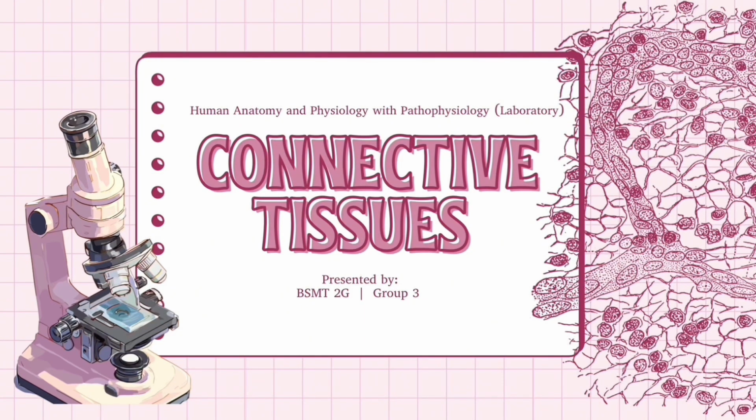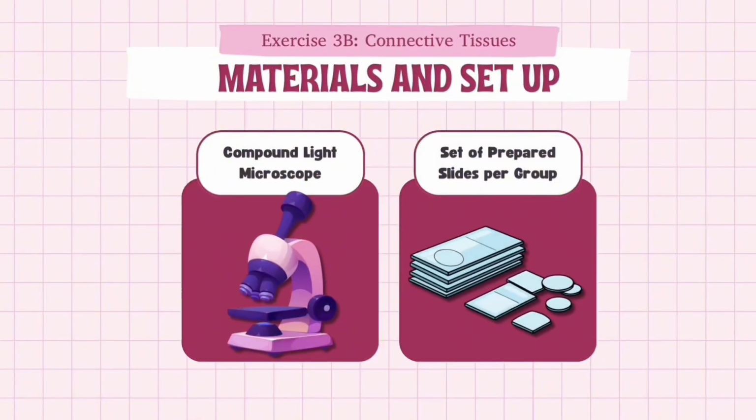Before we start the observation, let us first review the materials, setup, and procedures used in viewing these connective tissue samples. For this microscopic observation, the following materials were used. Microscope. Next are the prepared slides.